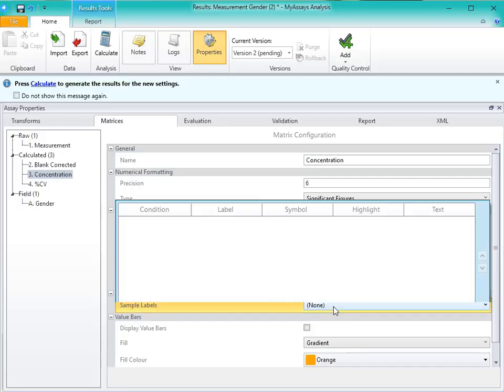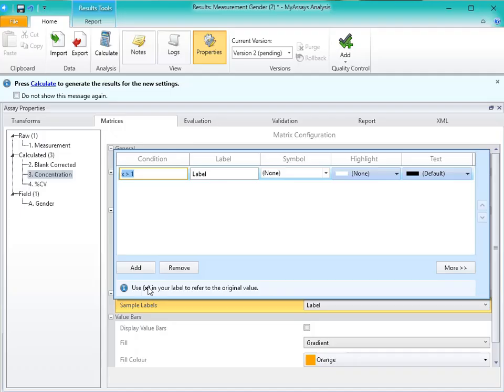However, if I wanted to use the same label, I could use a Boolean condition to evaluate in terms of x. For example, I could say, x is less than 10 or x is greater than 300 to satisfy my requirements, but you'll notice I only have the opportunity to add a single label in that case. So instead, I'll use the first condition as x is less than 10, and the label will be x surrounded by curly brackets is less than 10. So I can see the original value.